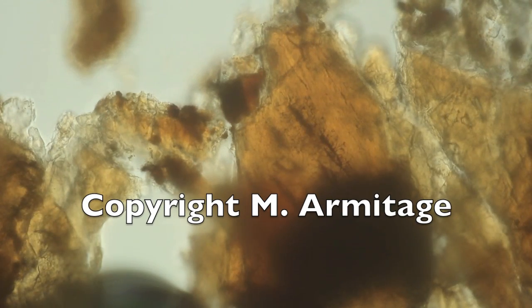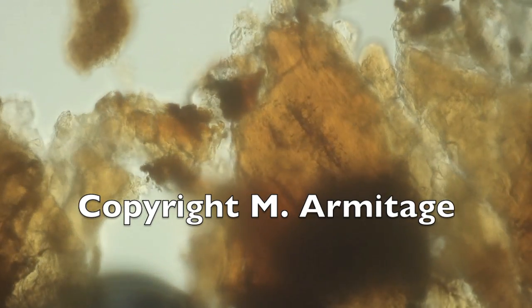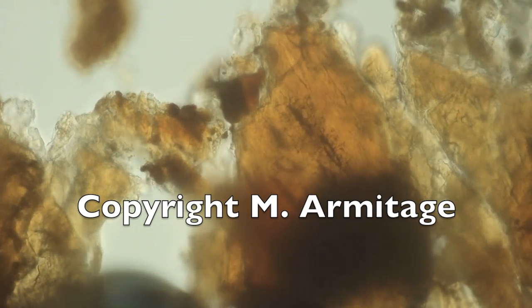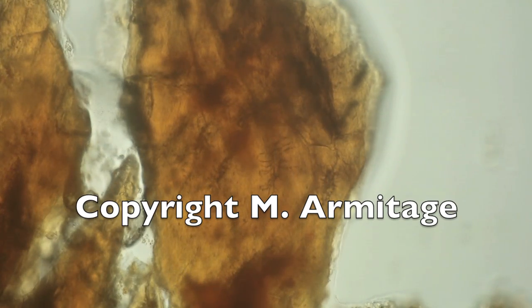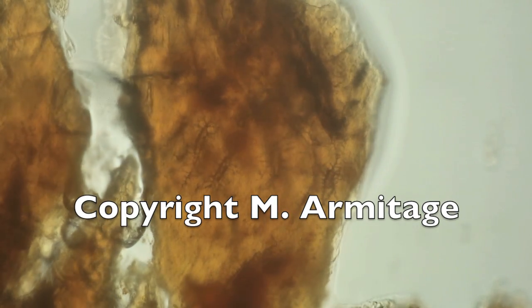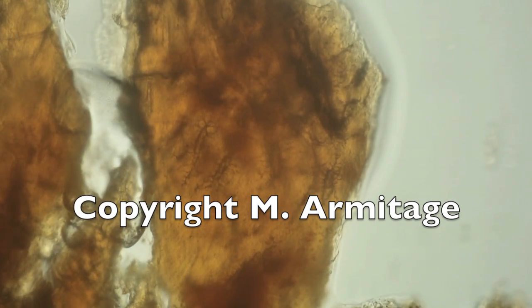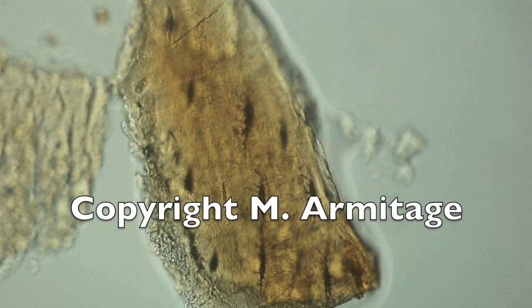The slide from the frozen section machine is now on my microscope. Focusing in and out on these pieces of soft fibrillar bone tissue, you can see the osteocytes with all their tiny little filipodia — their little thread feet reaching out from all sides of the cell. These are dinosaur bone cells. It's not contamination, because bone cells are only found in bone. For this to be contamination, cells would have to crawl out of some other bone, crawl across the dirt, and take up residence — which is preposterous. These are real dinosaur bone cells. As I focus in and out you can see all of these beautiful osteocytes.